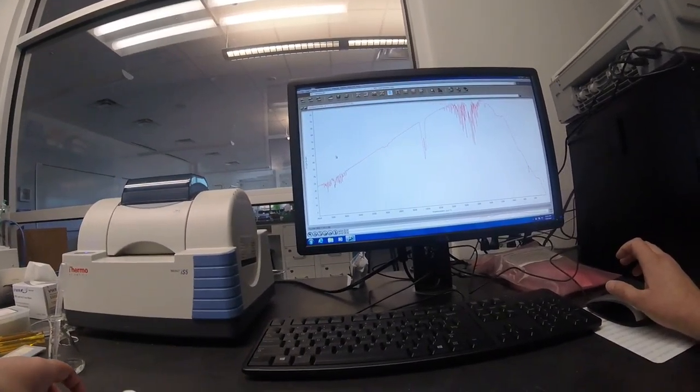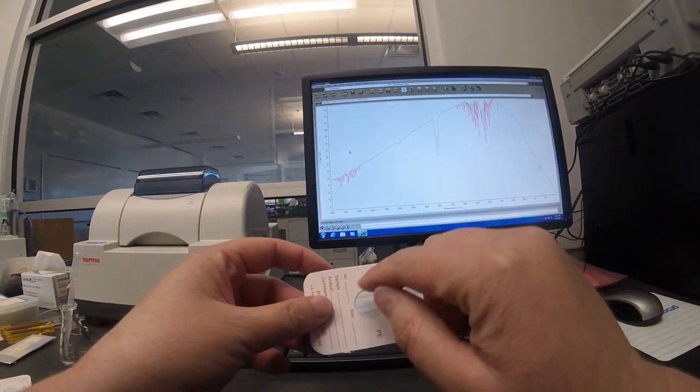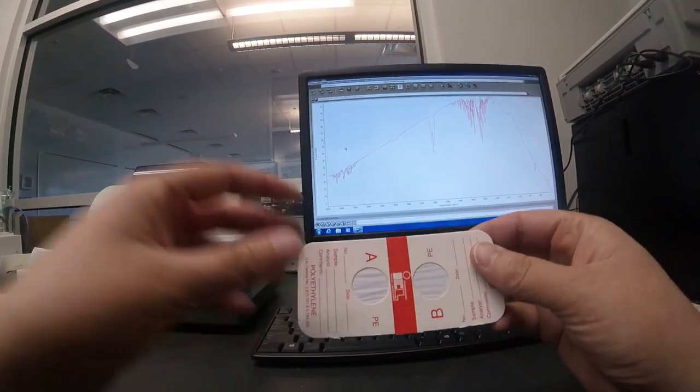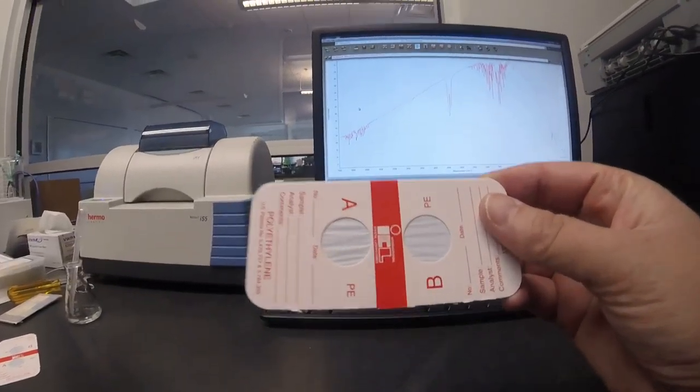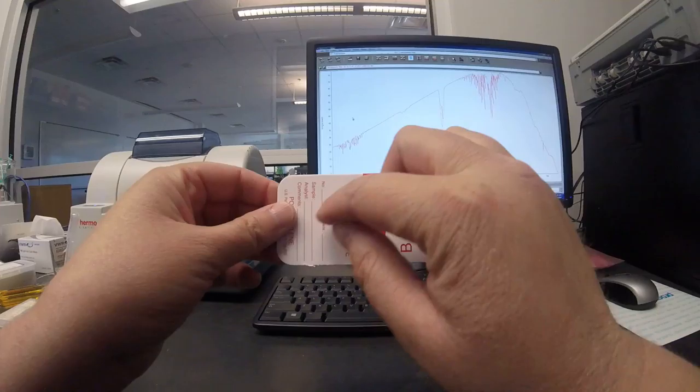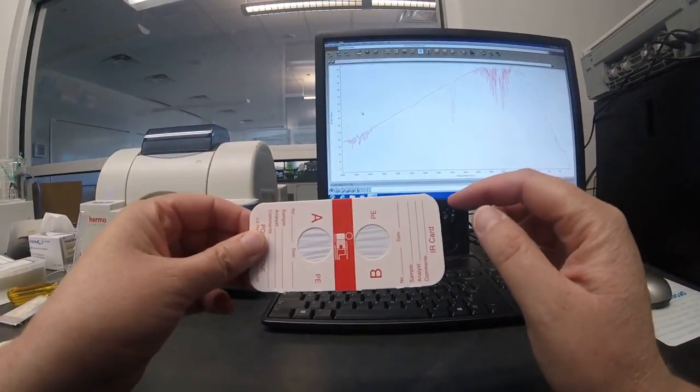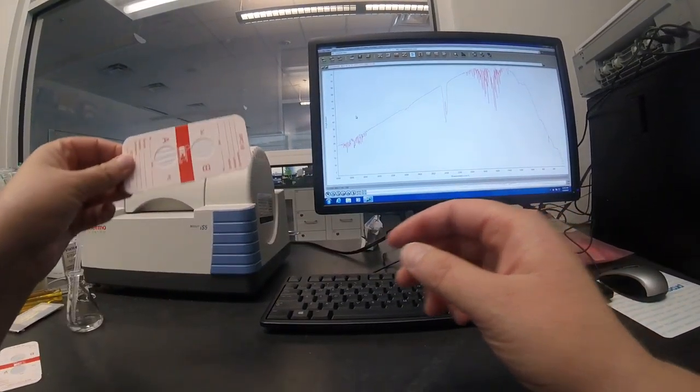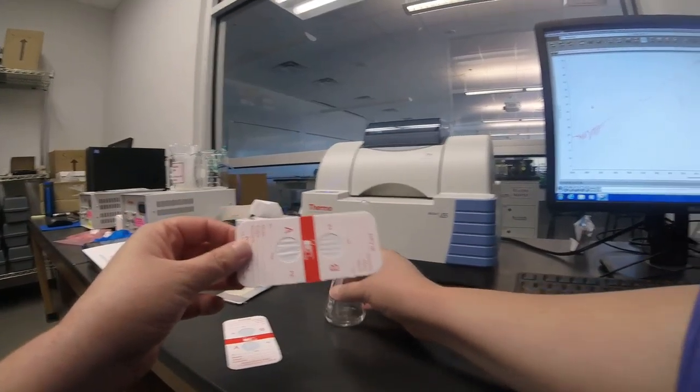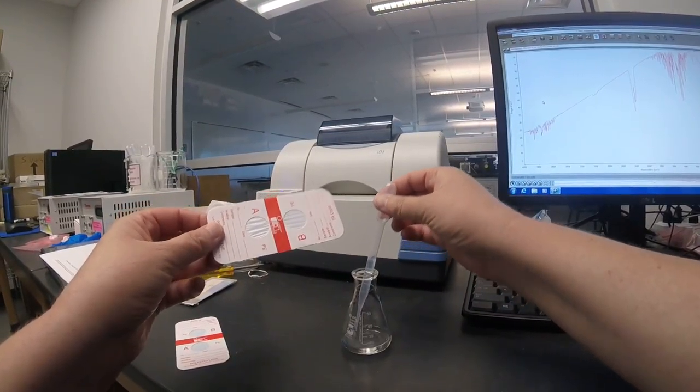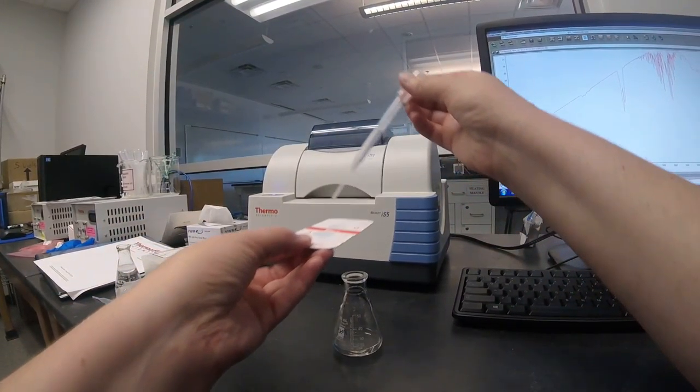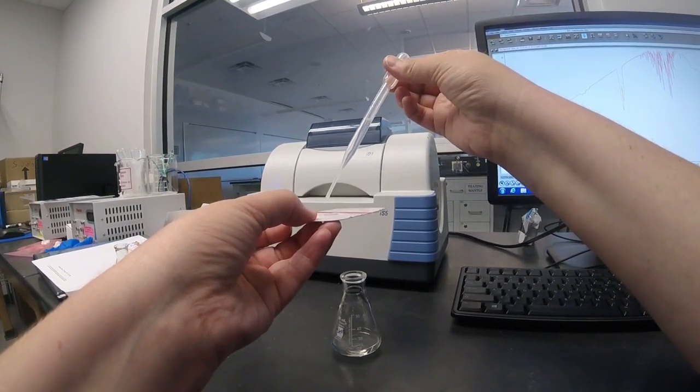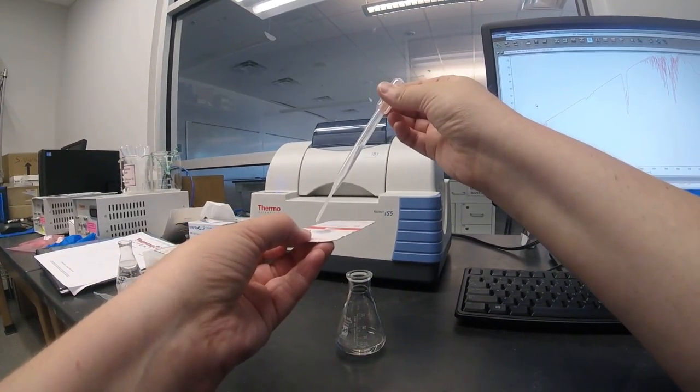So the way I do this is I'm going to take one of these, and I'm going to put my sample, since it's a liquid, I'm going to put my sample right on here. And then I'm going to put it into the scanner. So this is the easiest way to do this. This is a little bit of ethanol. I put it straight on just a few dots.